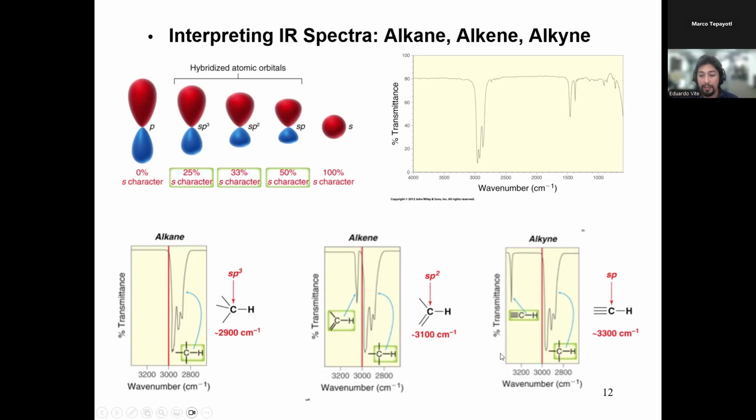Double bonds are a little bit less. So you see here the triple bond is at around 3,300. You see the double bond here shifts to about 3,100. And then you see here the single bond actually gets blended in somewhere between 2,800 and 3,000. And so if you have no other functional groups, you could still get some information about the types of bonds in the molecules based on the absorbance of your infrared radiation.